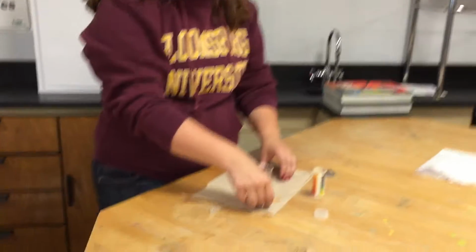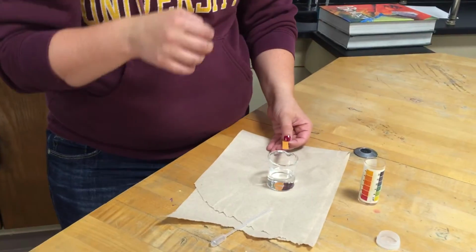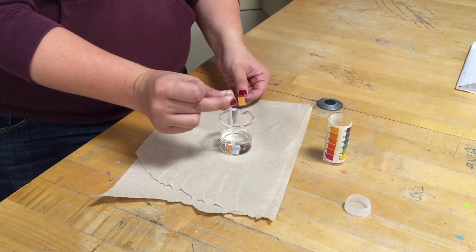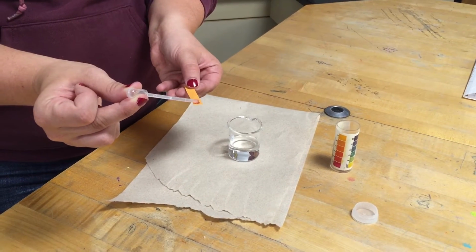So we're going to take our pH strip. We don't want to dip it straight into the liquid. If we do that, we could cause contamination. So we're going to take a pipette. You squeeze the top of the pipette to suck up some of the liquid, and we're going to put just a drop or two on the end of the pH paper.